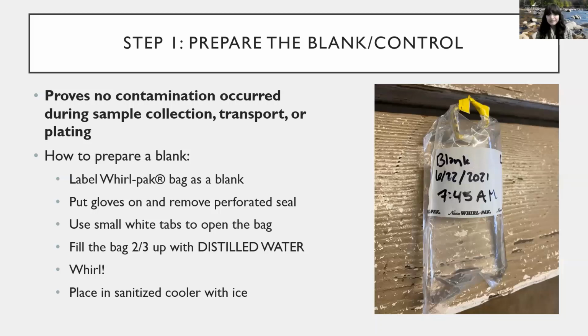A quick note, you can prepare this blank at home, but if you do that, then you should immediately place it in the same cooler that you'll be taking out to your site, or you can prepare the blank out in the field. However, just keep in mind that all the samples that you collect, including the blank, must be processed, plated in the incubator within 24 hours of collection. So just be mindful of that, whatever way you decide to do, but it'll probably make more sense as we go along further with the steps.